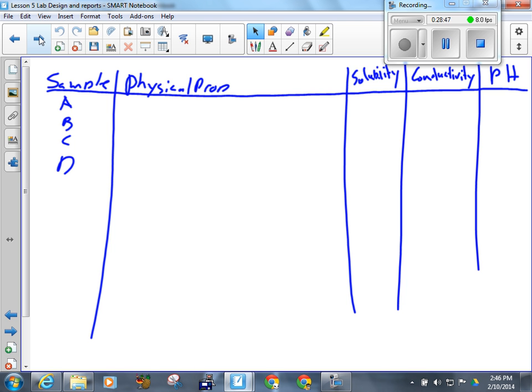You don't want to lean forward into the hydrochloric acid because your hair will curl up and smell bad for a long time after. Well, yeah, it's not a nice perm though. It's a chemical curling of your hair. It's also not all that good for you. So keep that kind of stuff in mind, guys. Please make sure you dress appropriately for the lab, probably not your best duds.